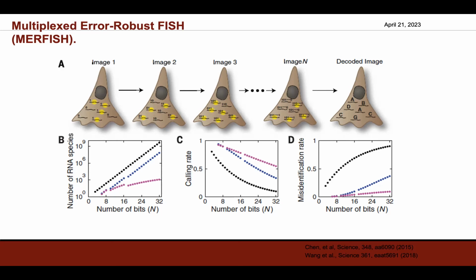of the binary code, such as 0 and 1. Then after you deliver all the probes into your samples, you can do different imaging cycles. There will be an imaging probe which is very specific to each individual oligo hybridization probe. So when you really do the imaging, you come out with a sequence of these imaging probe hybridizations. So you deliver imaging probe 1, 2, 3, 4.